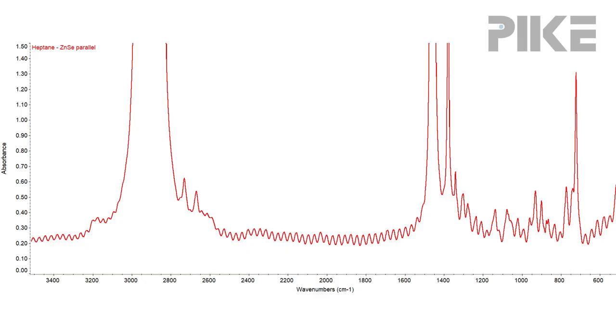Hello and welcome to the tip of the week. Today let me show you a spectrum of heptane collected using our demountable cell. The path length was 0.1 millimeters and I used zinc selenide windows.